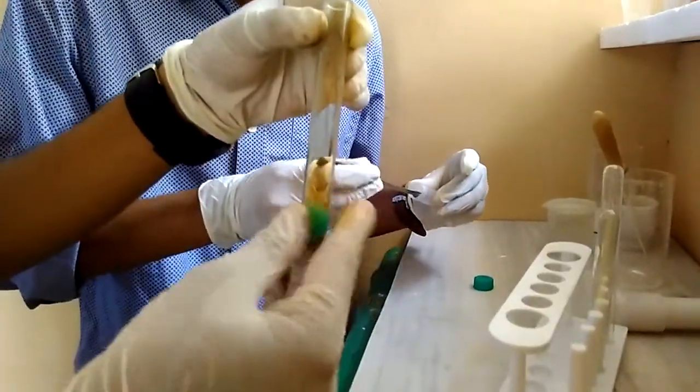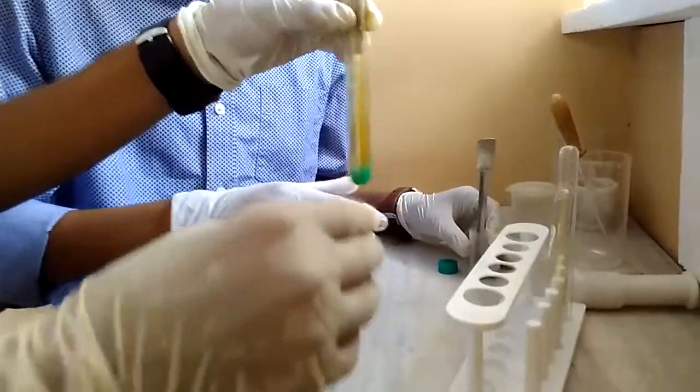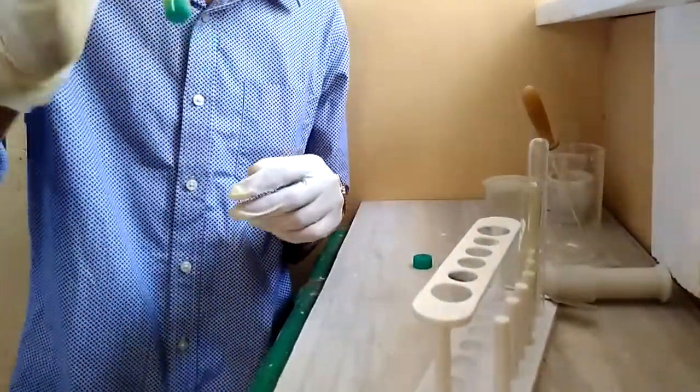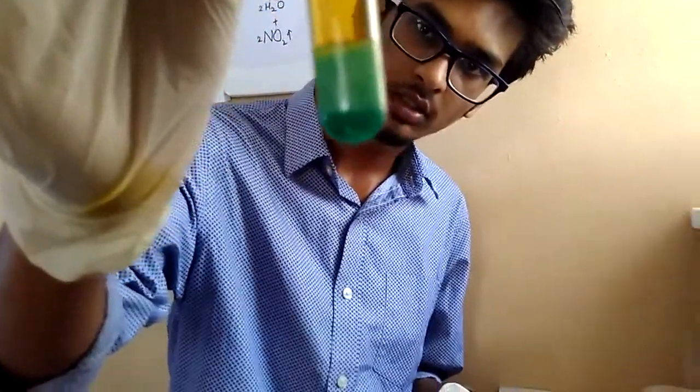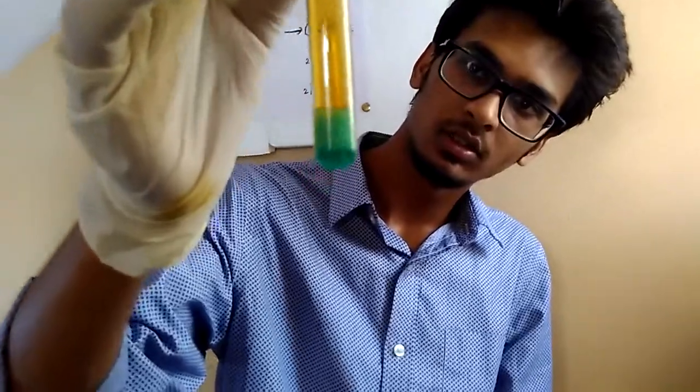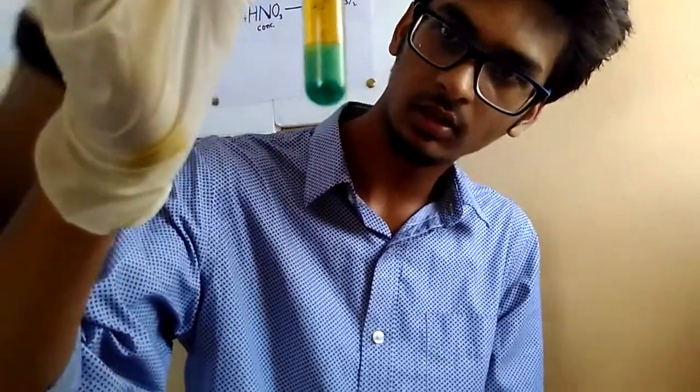You can see that the brown color. And blue color is nothing but copper nitrate, which is in the solution. And this good release of nitrogen dioxide.